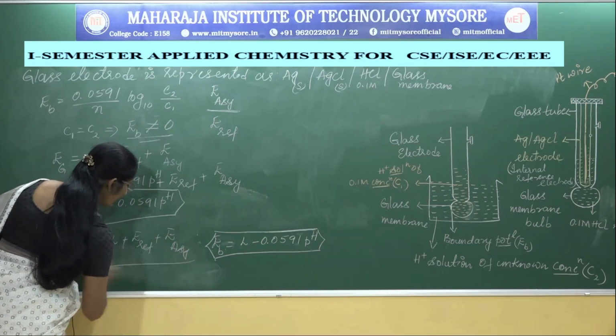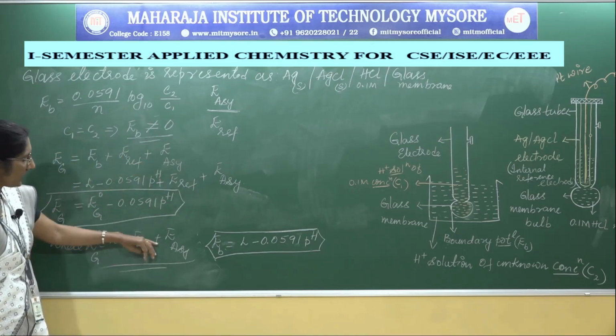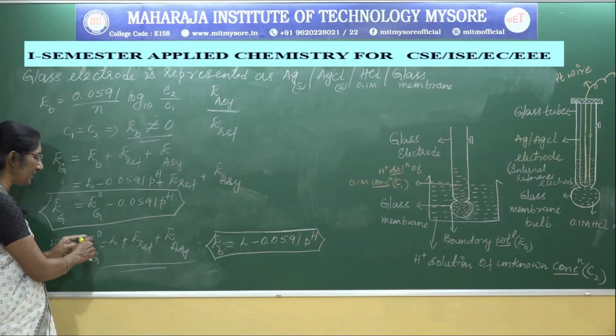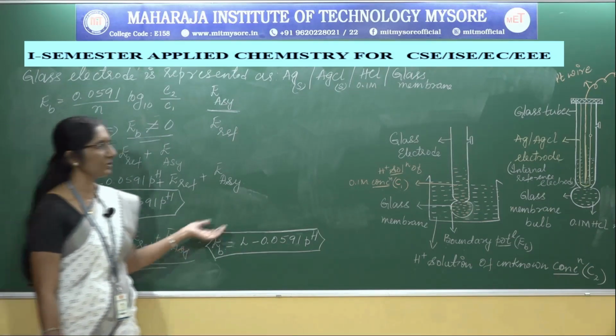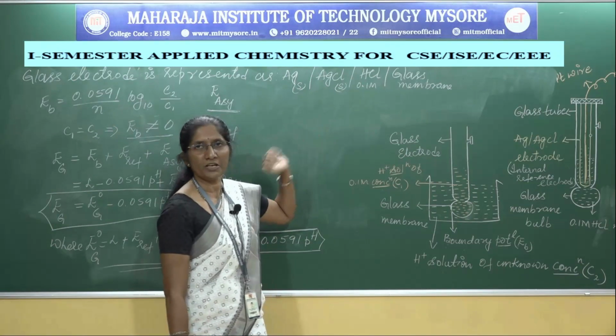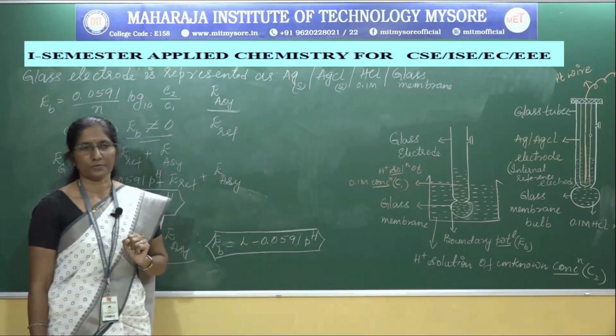This is calculated by placing this glass electrode in a solution of known buffer. Then we can easily calculate the value of E naught G. Next we will discuss the determination of pH of a given solution by using glass electrode.